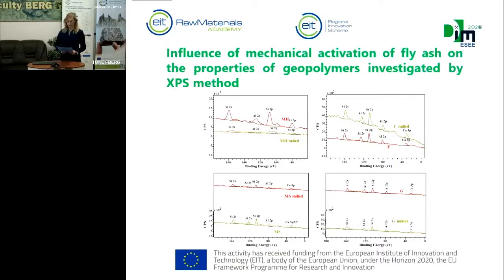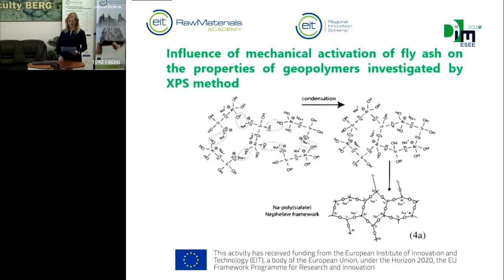Peak positions of atoms of carbon, oxygen, silica, and aluminium confirm condensation of orthosialate molecules via reactive groups of silica and silica-oxygen-aluminium hydroxide. This formation and creating cyclo-trisialate structure and the formation of the polysialate chain. The creation of the polysialate chain you can see in this picture.